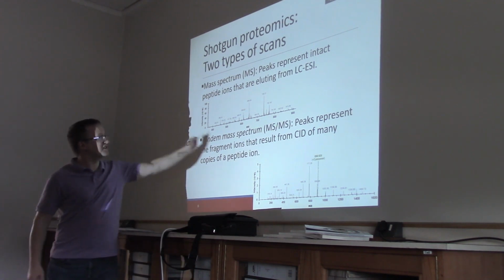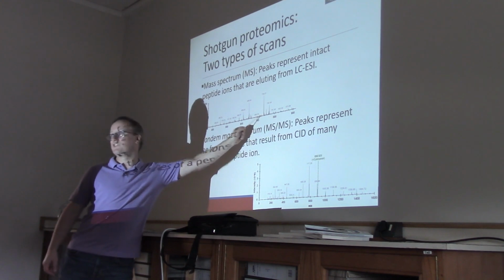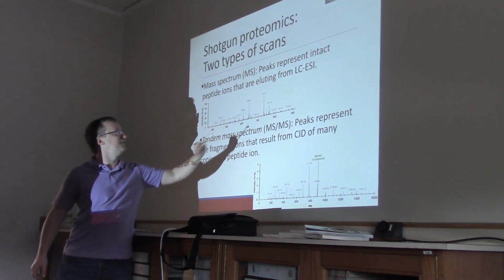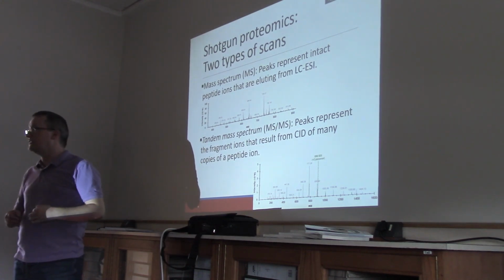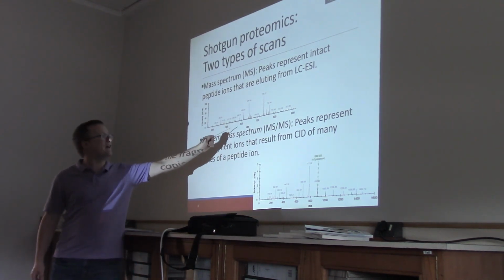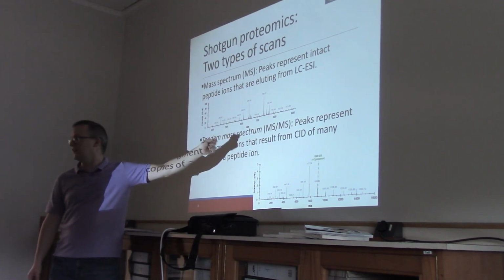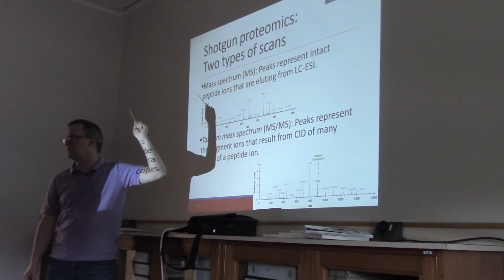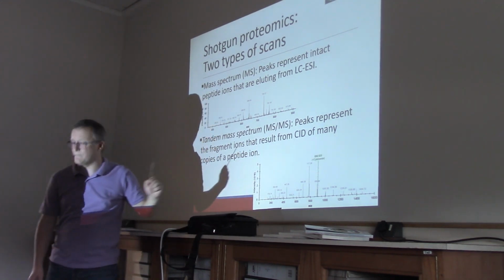Okay, so this mass spectrum then says to us we have an ion available for interrogation at 735, one at 645, 609, 767, etc. These are available now for us to interrogate. It's only after a particular ion has been selected from this, isolated, beaten up by pouncing it against a bunch of gas ions, and produces fragments, that we get a tandem mass spectrum.